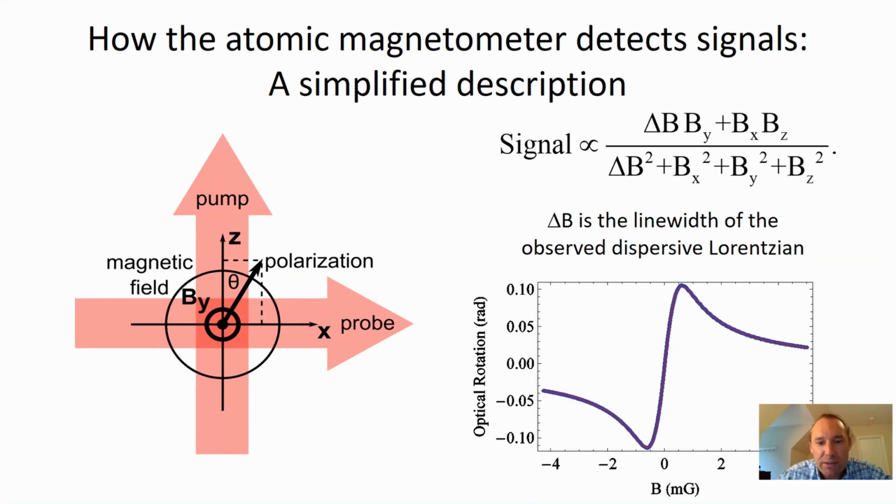And by changing the line width of your Lorentzian, you will also change the slope here in the middle. So one has to be a little bit careful, actually, because there's kind of an optimal for ZULF-NMR specifically. For highest sensitivity to the lowest magnetic fields, of course, what you want is a very, very narrow Lorentzian so that you have the maximum possible slope.